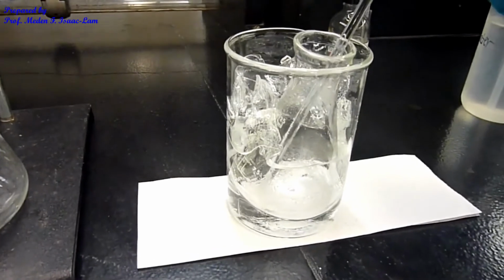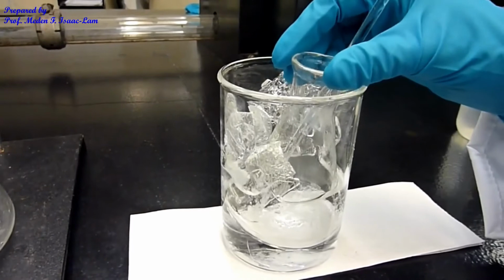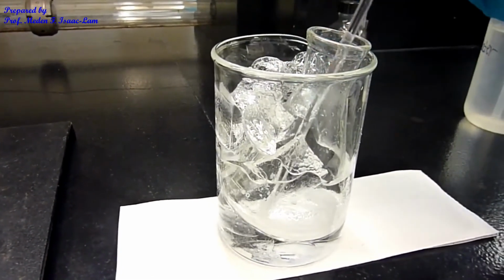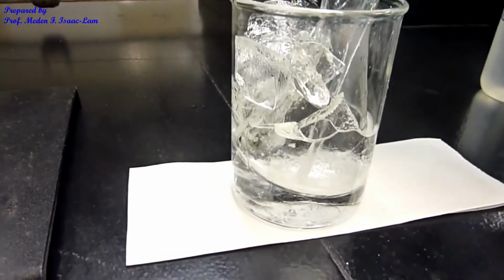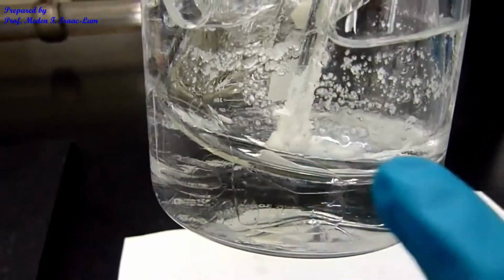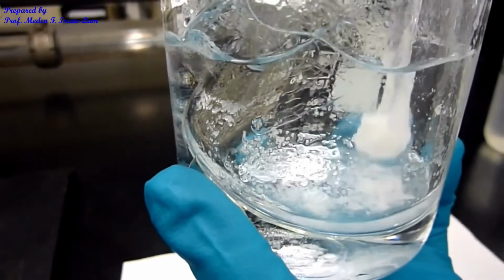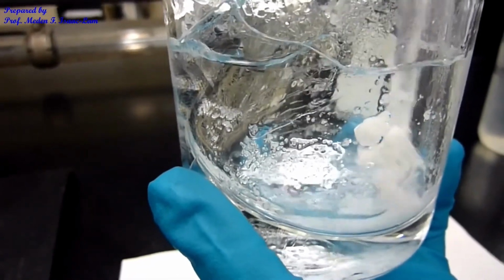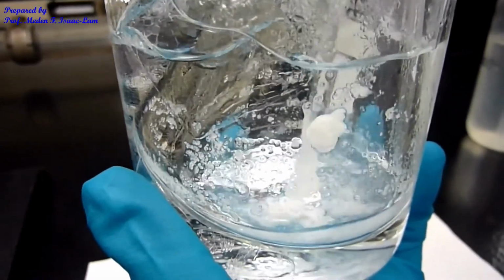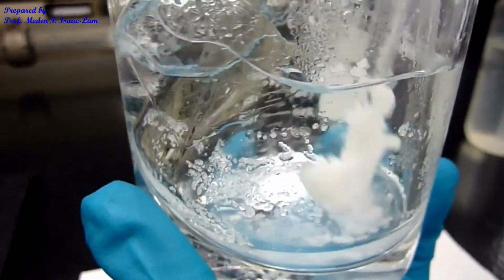After microwaving it for 1 minute and then chilling it in ice water and then scratching again, it crashed out immediately from the solution. So the aspirin product precipitated out, and you can see the crystals actually at the bottom. So we are now going to do filtration. You see the crystals here. It's white. Some are sticking on the glass, some are sticking on the stirring rod, so we're going to take that out. But it now came out of solution. So this is now our product.